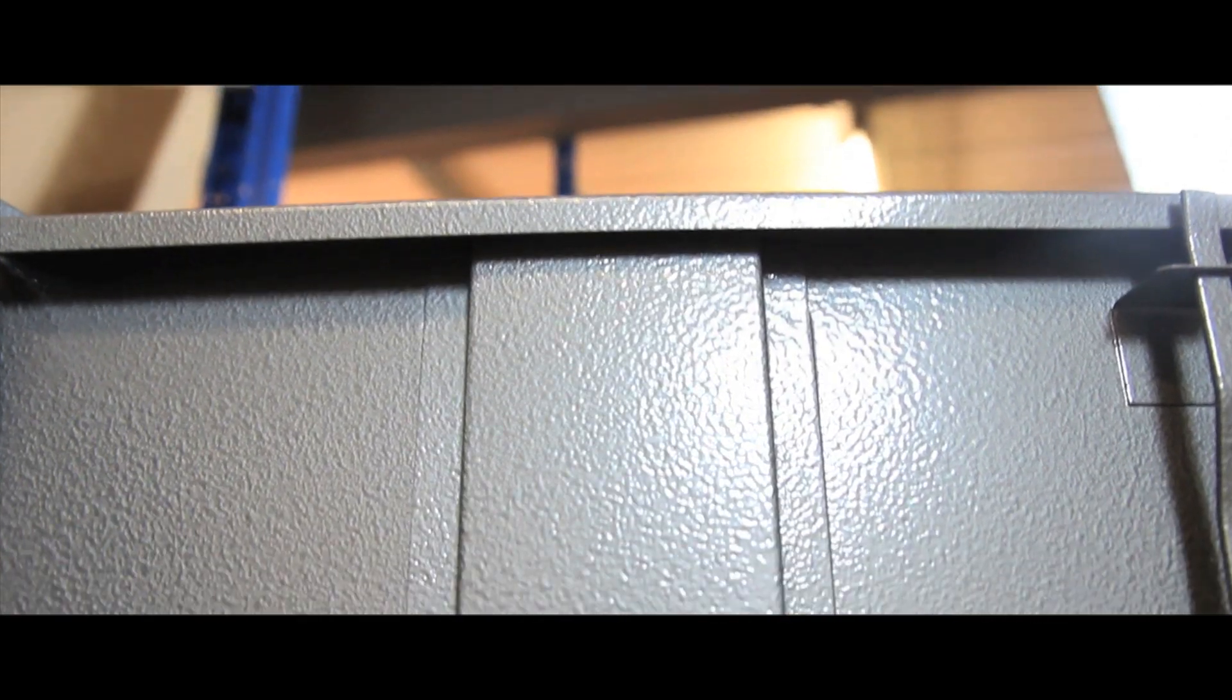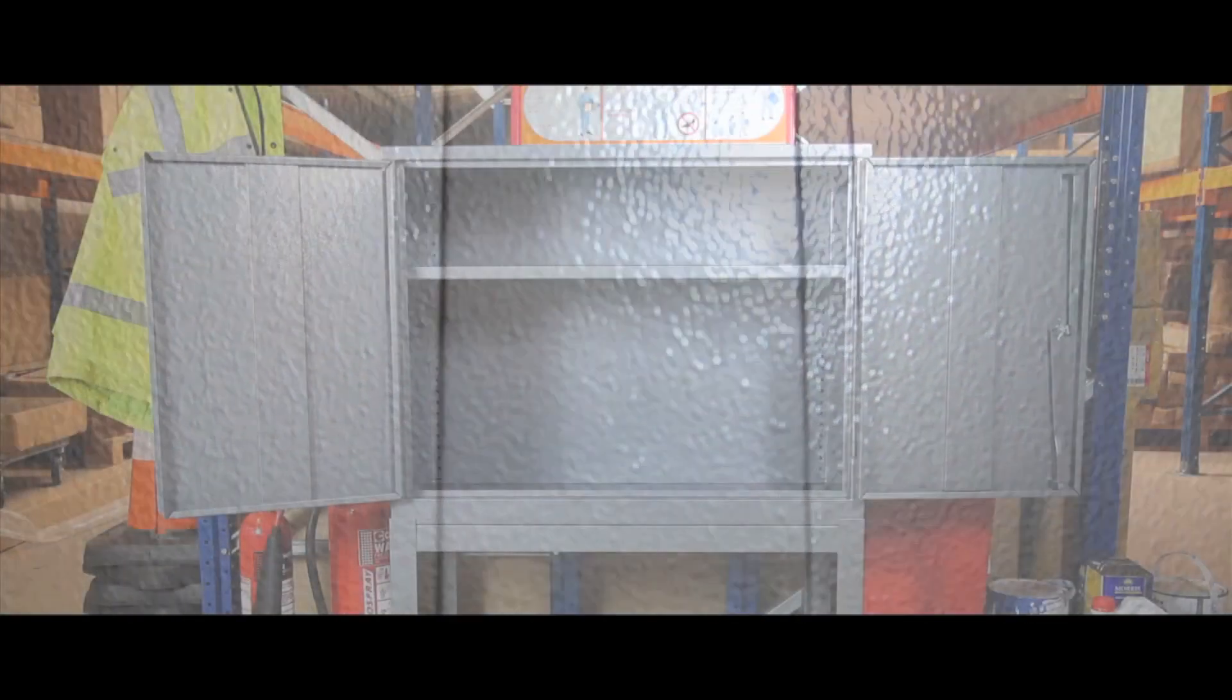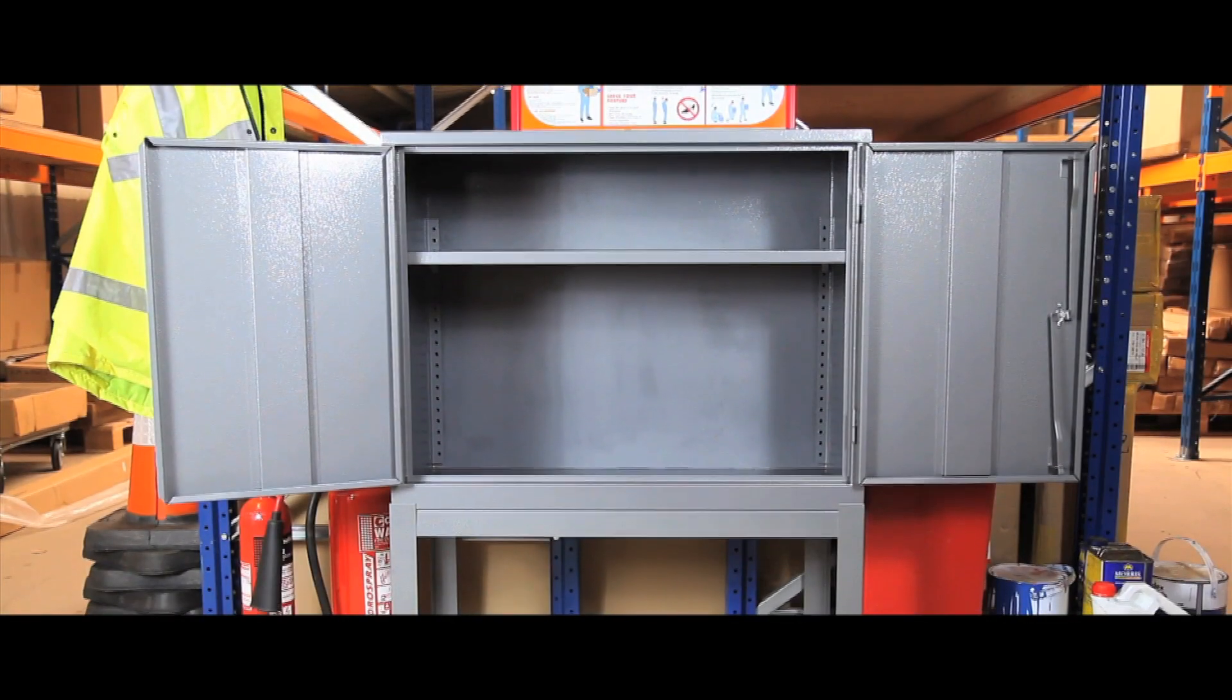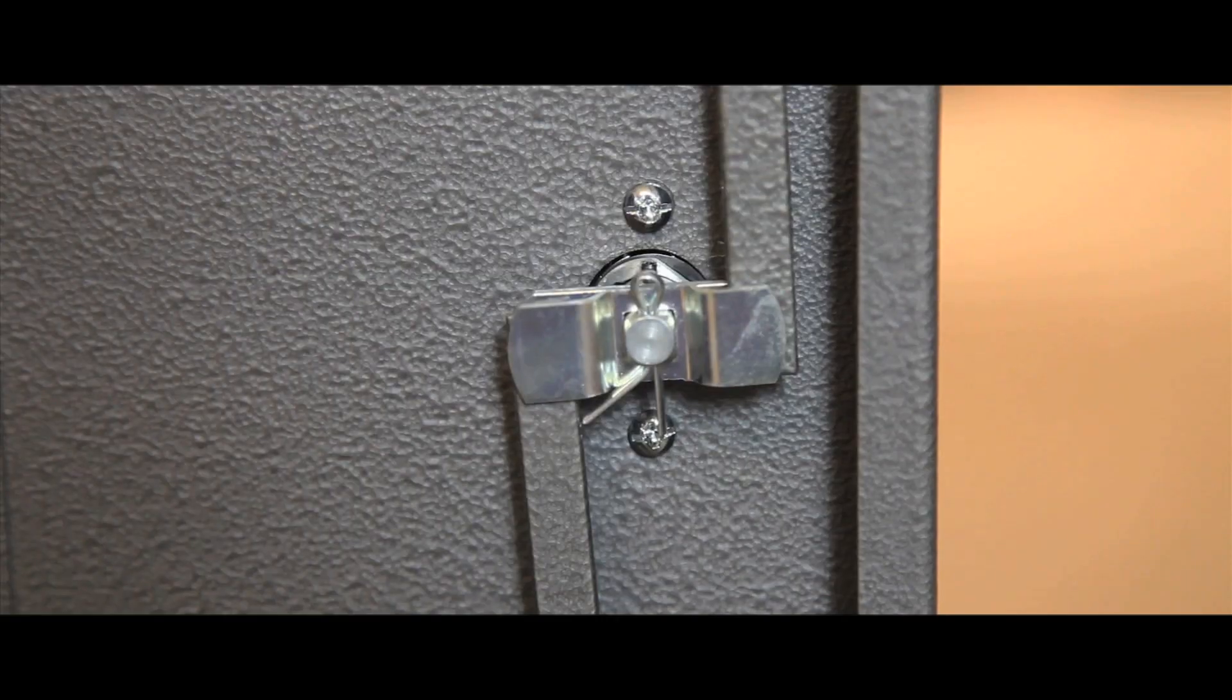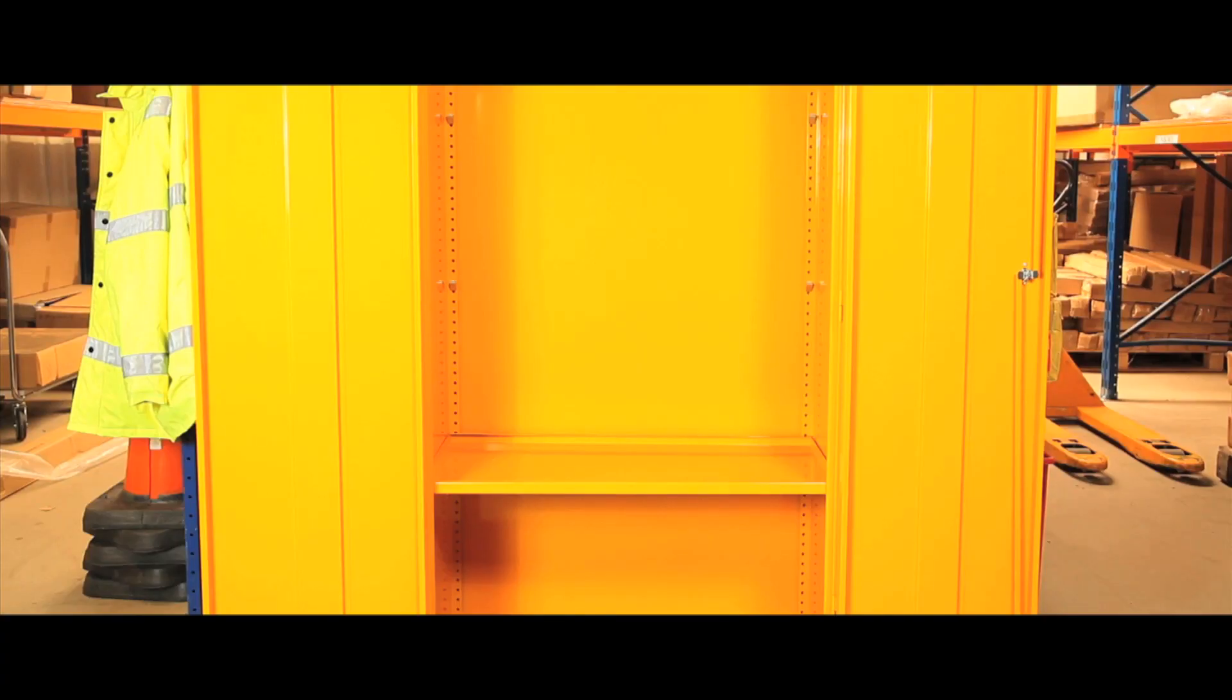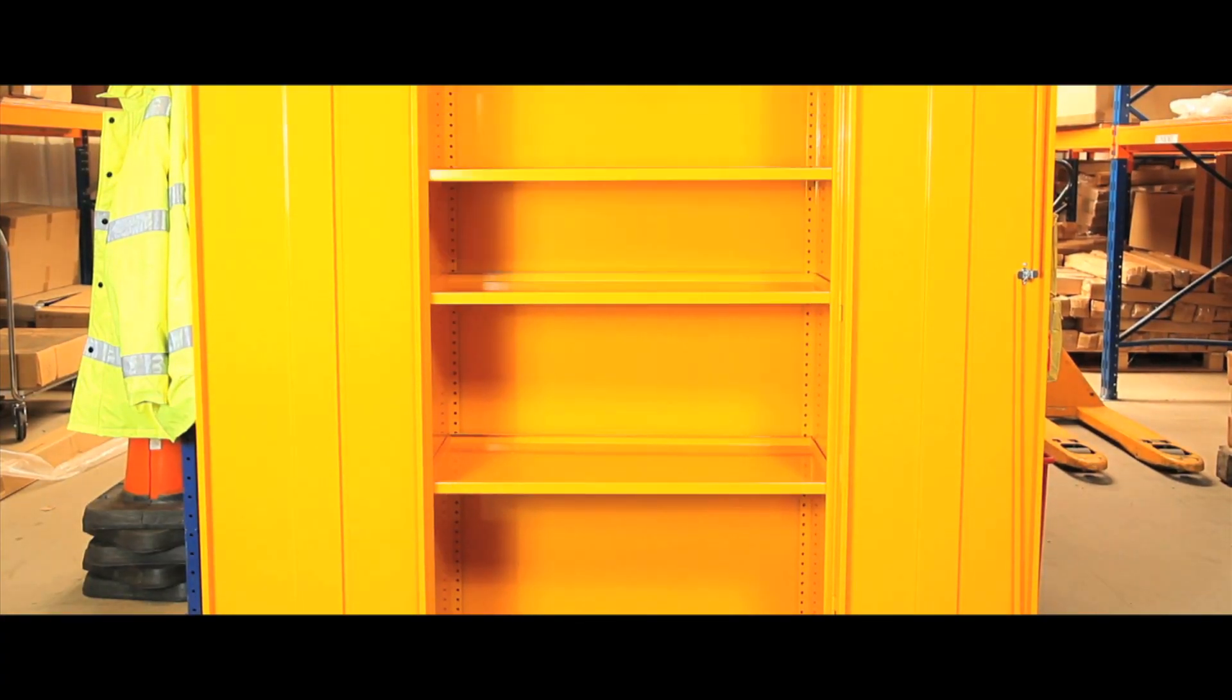Most models support a 50mm sump depth, whilst the larger sizes have a 150mm sump depth. The units come with either one or two reinforced doors with a two point locking system and one, two or three adjustable shelves.